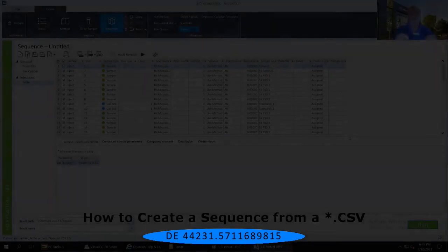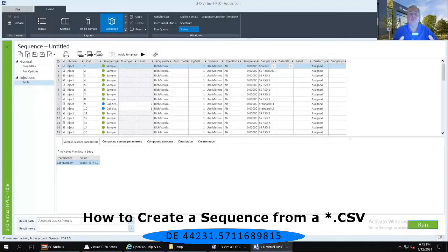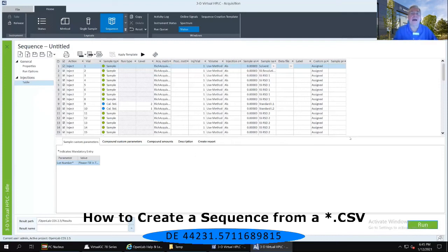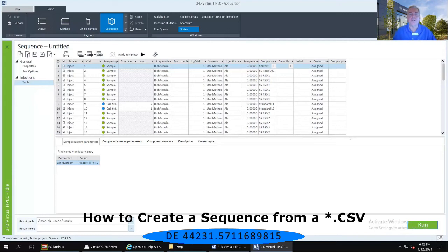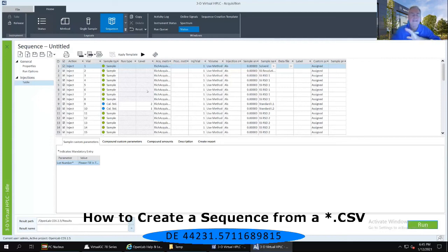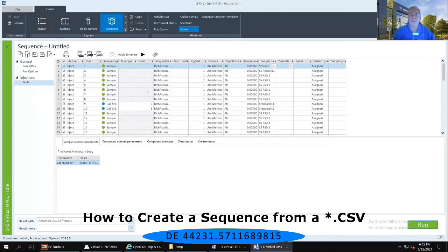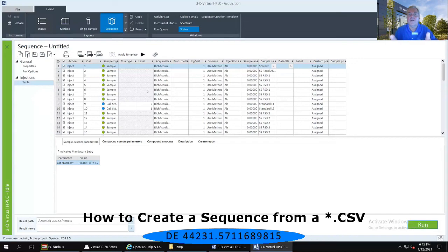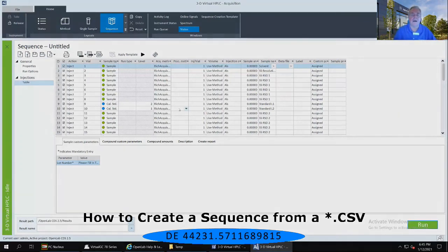Well, what exactly did you have to do to create that CSV? All you need to do, and I have customers that have a one-column CSV, I have other customers that have a hundred-column CSV. As long as the name of the column of that CSV is the same name as the column within the sequence table, it will map to the appropriate column. It does not have to be in any specific order. It can be outside of any order you wish, but as long as that column itself has the name as it appears in the sequence table, it's going to map to the right column.